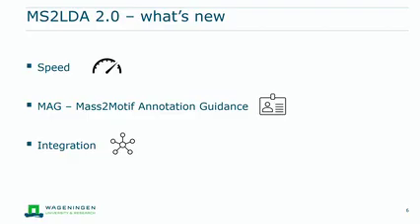First, we improved the speed a lot. So before, it was run through GNPS. If you already know more about MS2LDA, it was run by GNPS, but also through a server. However, for large data sets, or not very large, but kind of large, it was almost impossible to run. So now we increased the speed a lot, which allows you to also analyze large data sets that sometimes other tools take really a while to process.